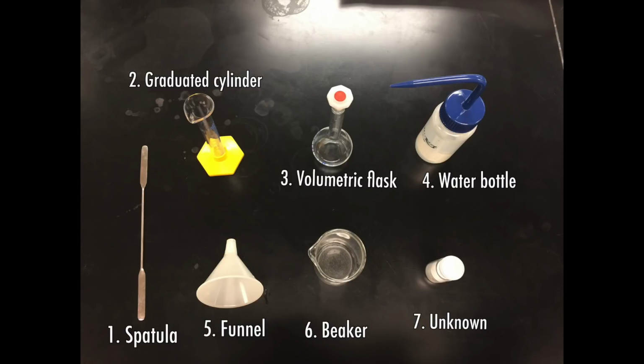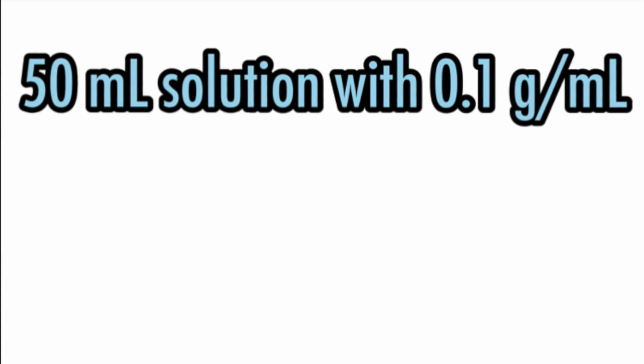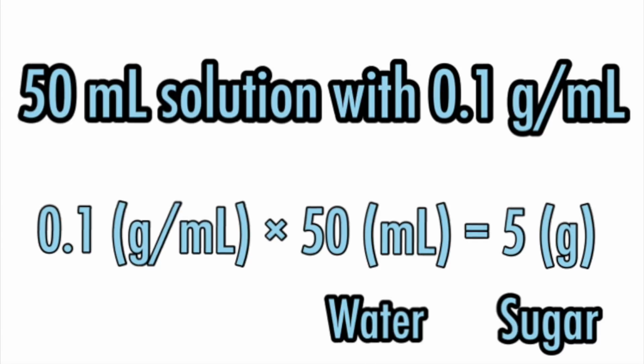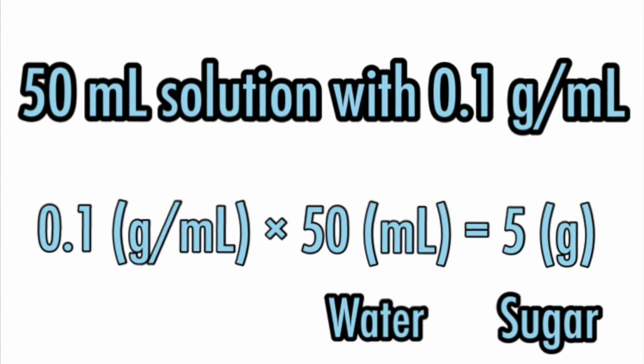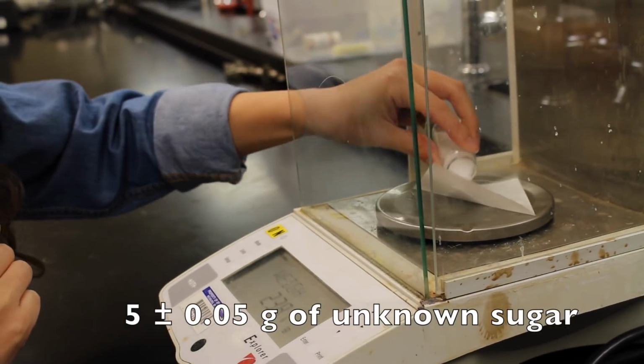In this lab, you are going to need these items. First, you are going to make a 50 milliliter sugar solution with a concentration of 0.1 gram per milliliter. To make this solution, you will need 5 grams of sugar and 50 milliliters of distilled water from this calculation. So first, measure 5 grams of unknown sugar.